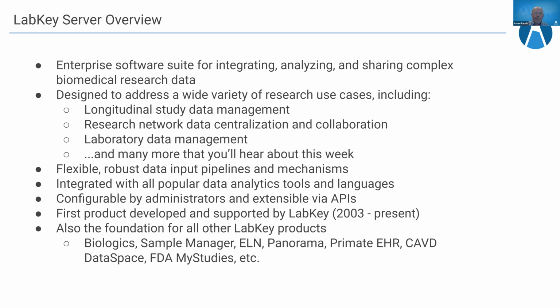Another way I like to think about LabKey Server, as one of those founders and one of those former Fred Hutch employees: LabKey Server was the first product that LabKey developed, and for 10 or more years was really the only product. But at this point, it is definitely not the only product. LabKey Server is always the foundation of every other product that we've developed, including Biologics, Sample Manager, the ELN, Panorama, et cetera. So LabKey is kind of the foundation on which we build all of these other products.